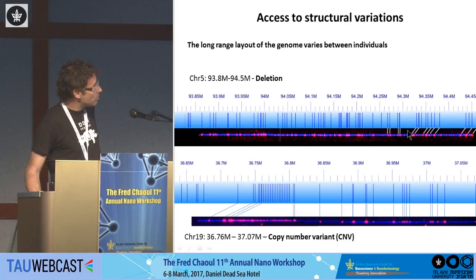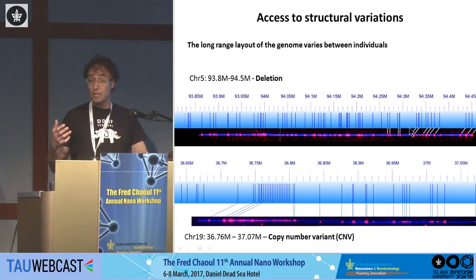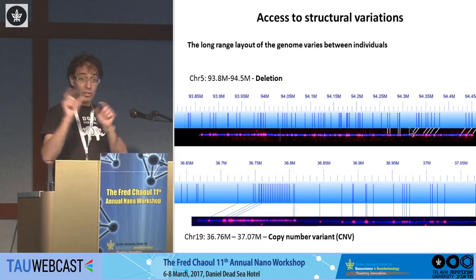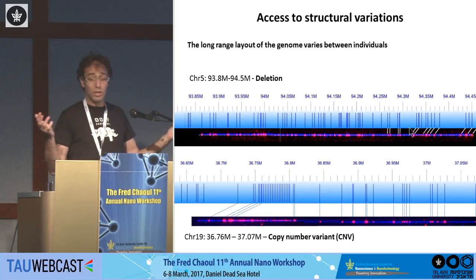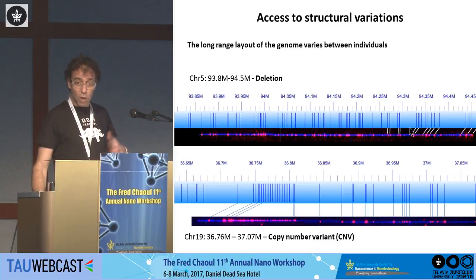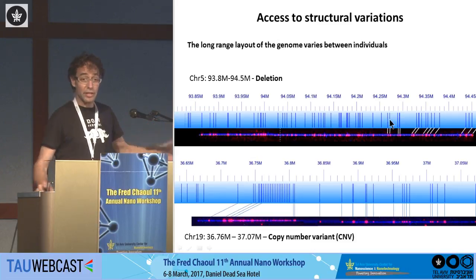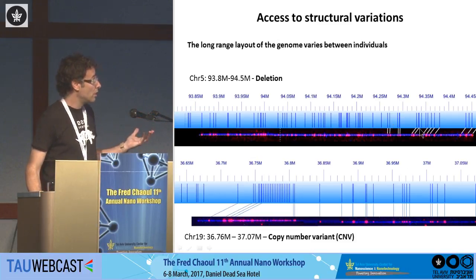It tells us that there is a piece of DNA missing somewhere in this region. This is called a deletion, a genetic deletion. This is one of the things that makes all of us different from each other. Small aberrations in our genomic structure, because the sequence of our genome is about 99.5 to 99.9% identical. And the differences between people on the genetic level mostly span from what are called structural variations. Things that are missing, duplicated, rearranged, all kinds of things, and these things we can see visually on the microscope.